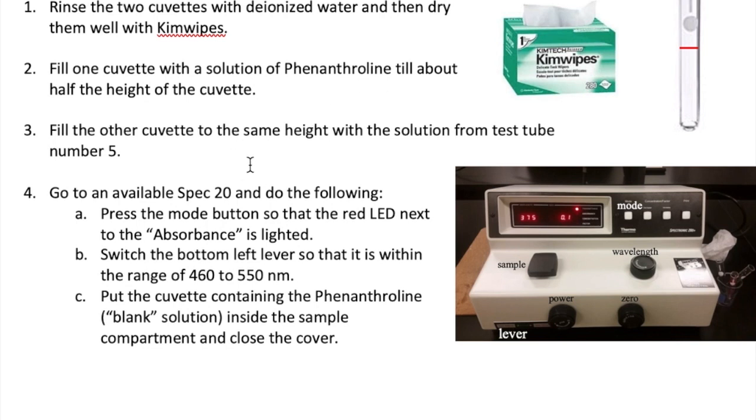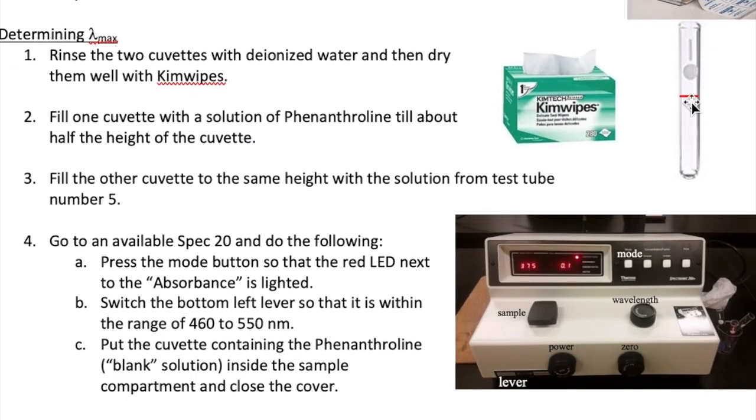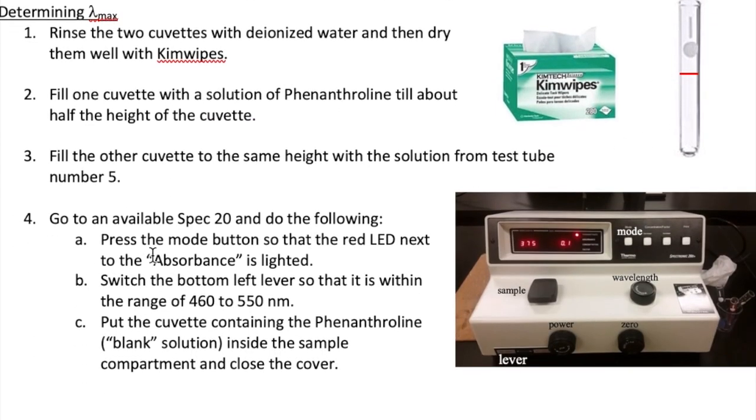To one of the cuvettes, add Phenanthroline until it's about halfway full, corresponding to the red mark shown here. To the other cuvette, add the solution from test tube number 5, which you made earlier, also until the cuvette is about halfway full. Take these two cuvettes to an available Spec 20. You will now perform a scan to find your lambda max.